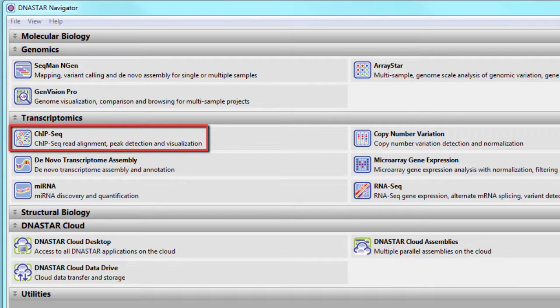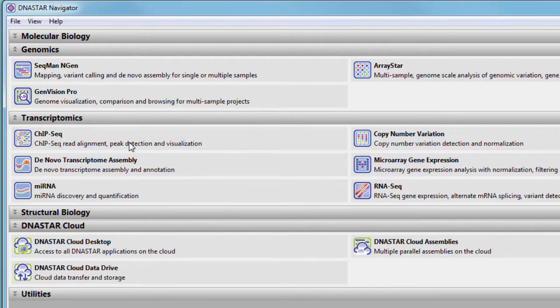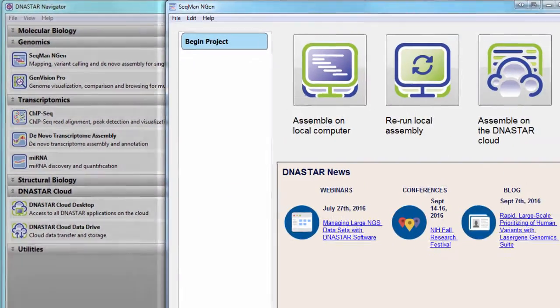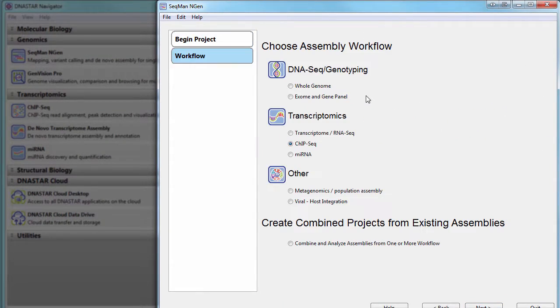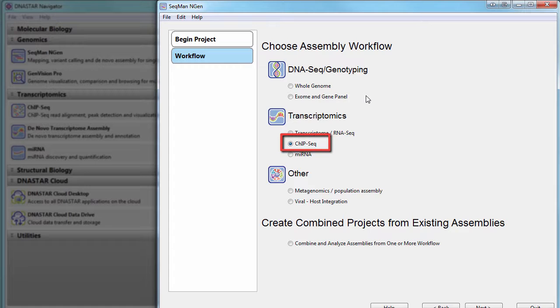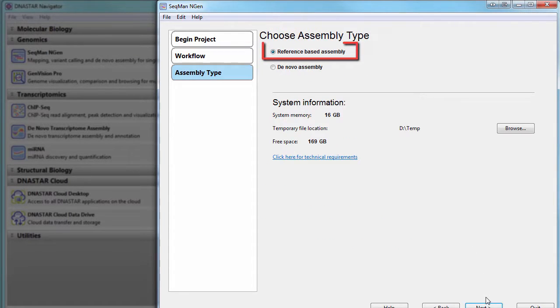To analyze ChipSeq data in LaserGene, first set up a new assembly in SeqMan Engine. Choose ChipSeq from the workflow page and select Reference Based Assembly.